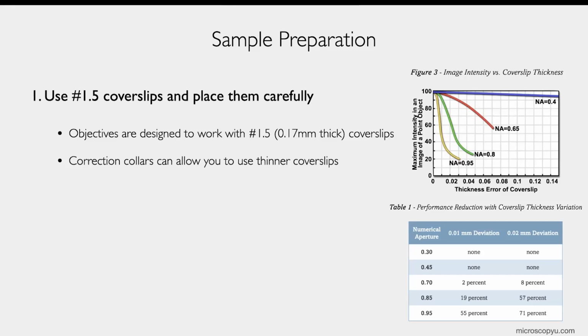So if your lab is using number 1 cover slips, which is very common, that's too thin, and vice versa if they're a larger thickness. And the biggest difference is, if you're just doing very simple imaging with the 10 times objective, you won't necessarily notice these differences. But as soon as you start to do high resolution imaging with oil objectives, you can see in the plot on the right-hand side, you'll have a drop in intensity, as well as other effects coming into the imaging. So it's really important just to solve this simple problem by using the right cover slips.